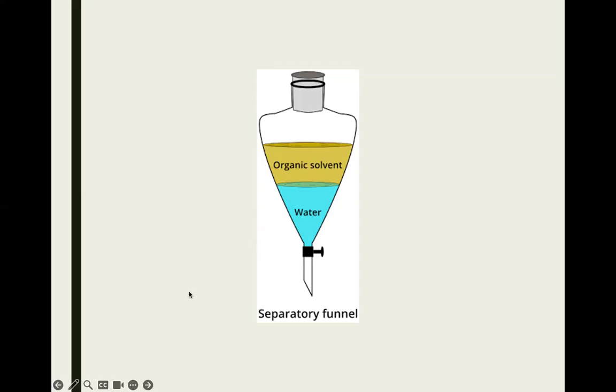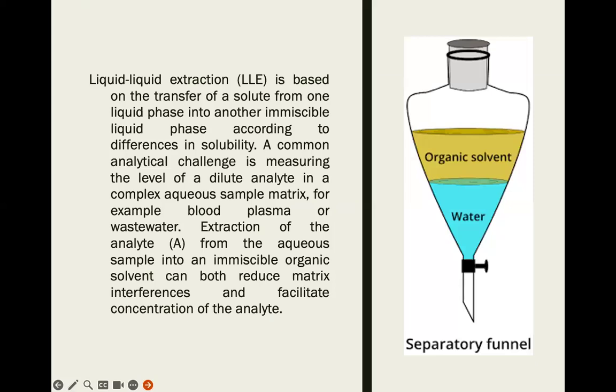Okay, so we have to know some theory on how to conduct this. And first and foremost, we need to know the mechanism. So liquid extraction, in this case solvent extraction, is based on the transfer of solute. If you do not know what a solute is, it's easier to label it as the analyte of interest, the one that you want to measure, the one that you want to transfer into the organic solvent.